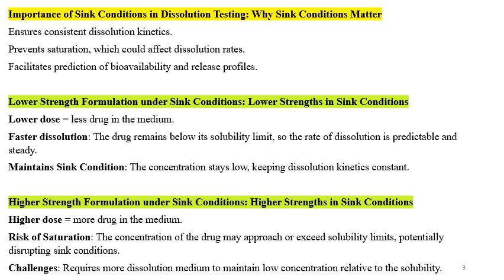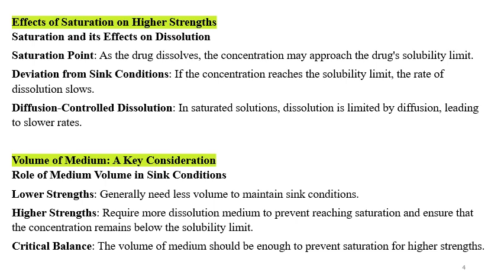So there are some challenges for the higher strengths. Higher strength requires more dissolution medium to maintain low concentration relative to the solubility. But taking more volume is also a challenge, because you cannot take more than the recommended ranges.